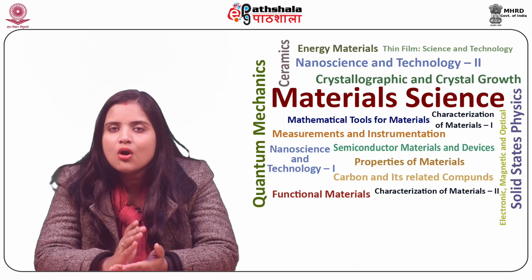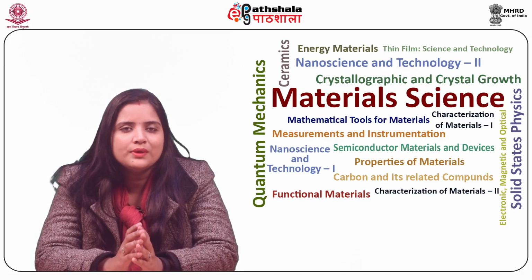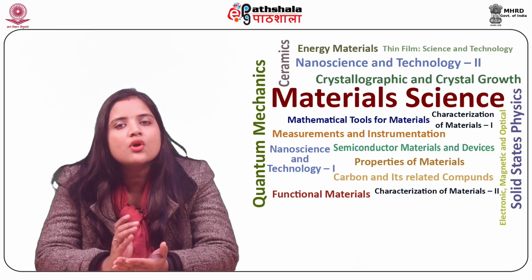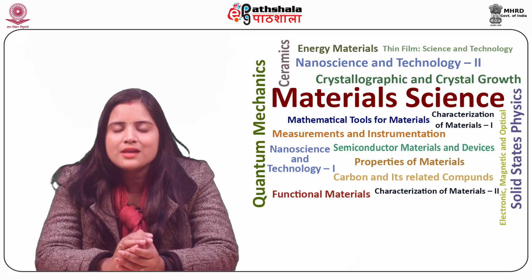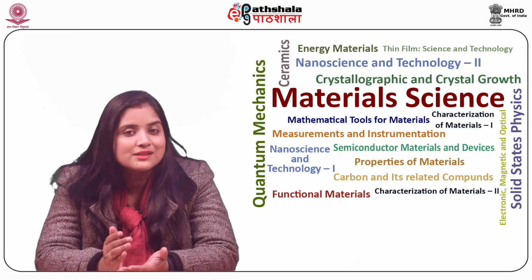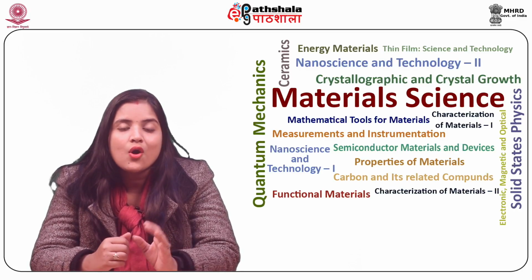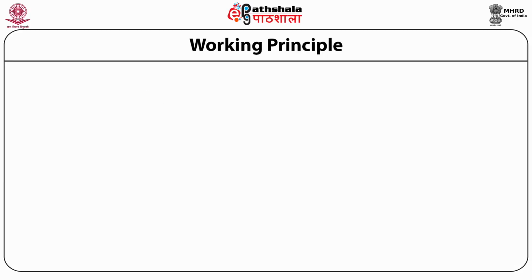It is a non-destructive analytical technique. It is a microbeam instrument. It determines the local composition of solid samples. Basically, its working is the same as scanning electron microscopy, with the additional ability of chemical analysis. It provides detailed X-ray mapping of composition contrast. Let us discuss the working principle of electron probe microanalyzer.